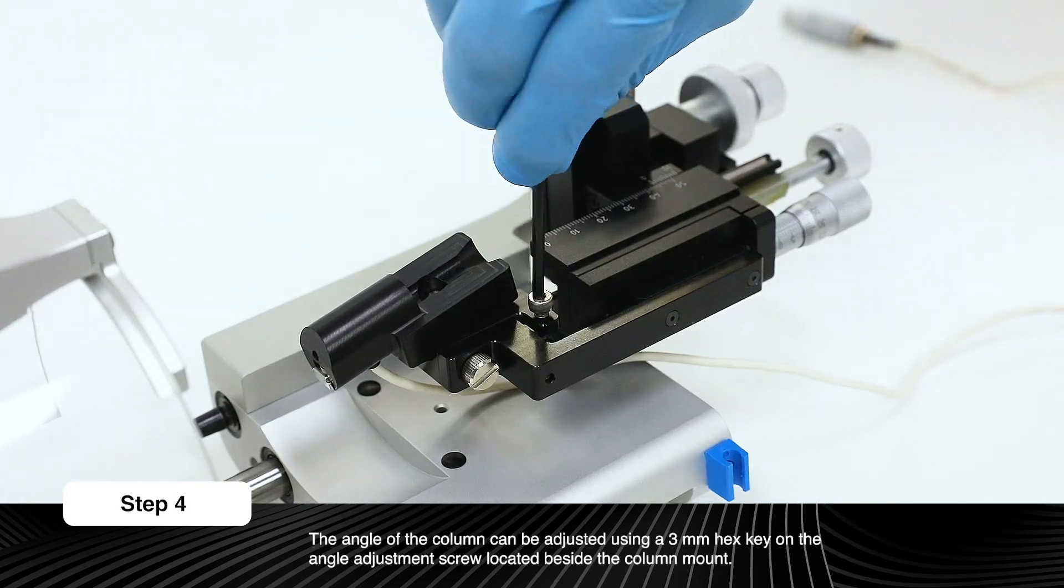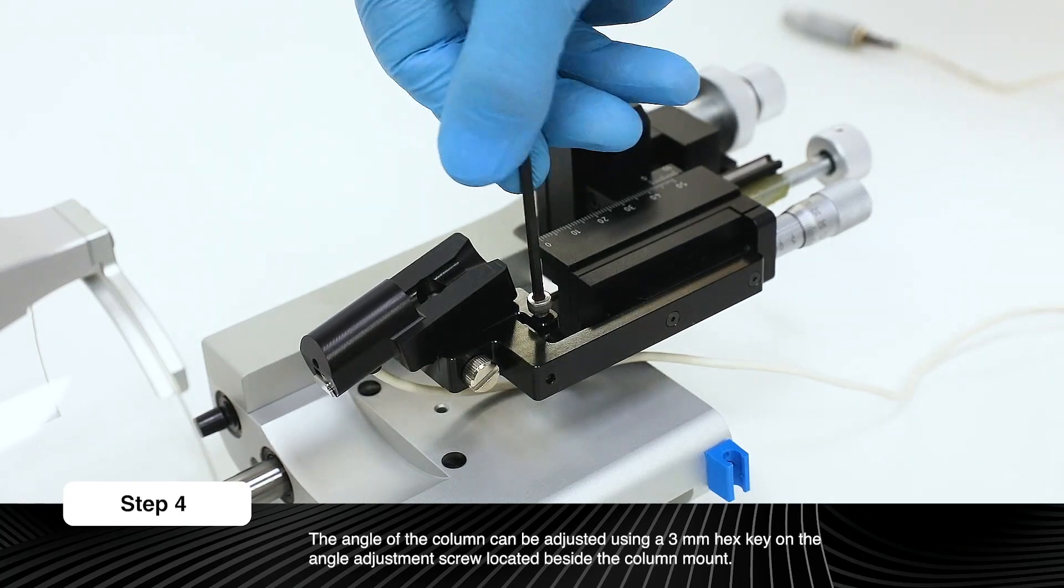The angle of the column can be adjusted using the angle adjustment screw located beside the column mount.